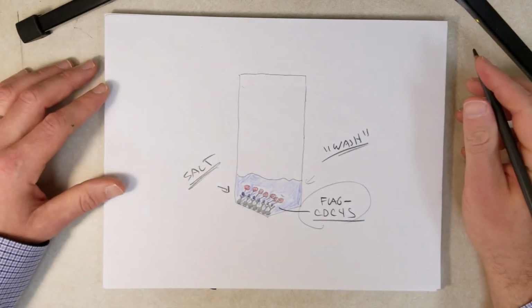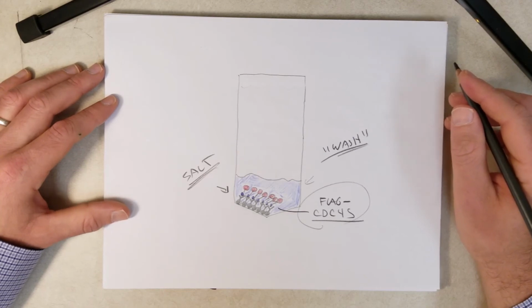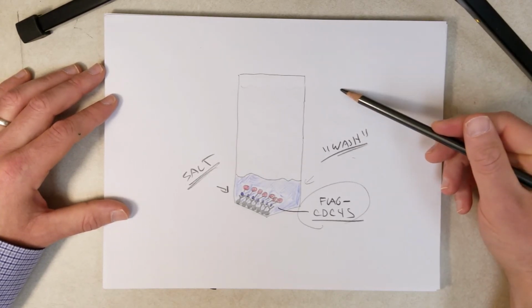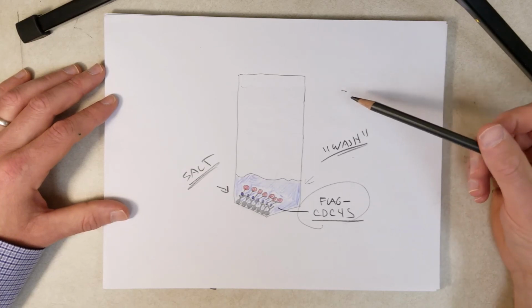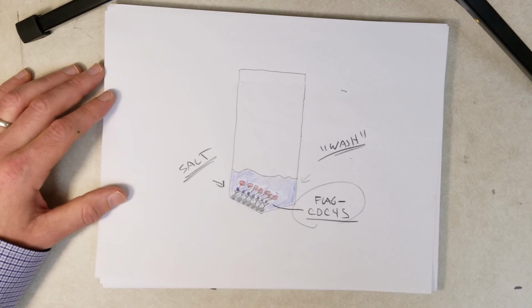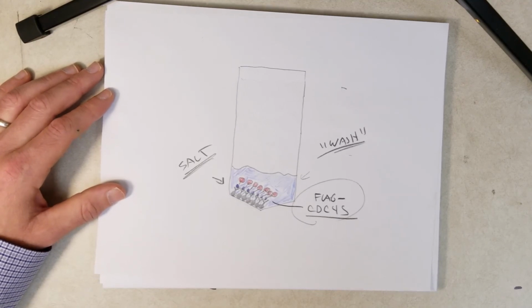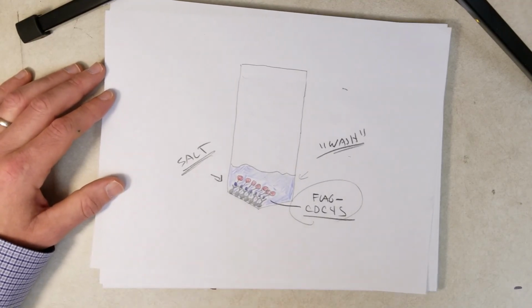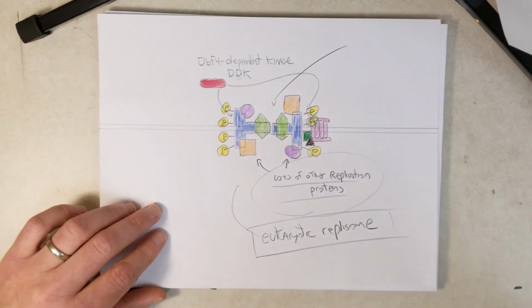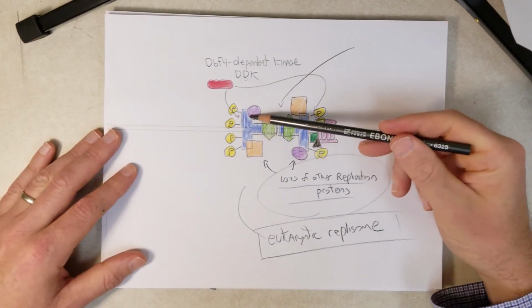So immunoprecipitation is pretty easy if you can get your transgene into the organism, into the host cell, and get your total proteins. The hard part would be, let me see if I can go back to, where's that? Would be doing that for all of these proteins, right?